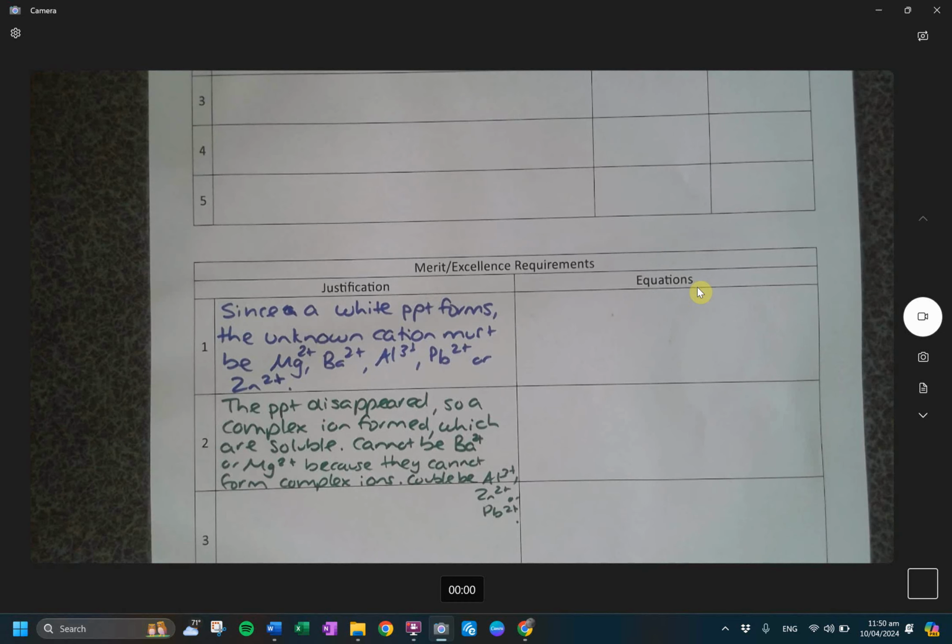Problem with it is that it's not always, you guys used a lot yesterday. A lot of problem solving that you guys are gonna have to do. This is why I give you guys the known solutions, right? That way you can use it as backup. I might start over, see if you get more luck.